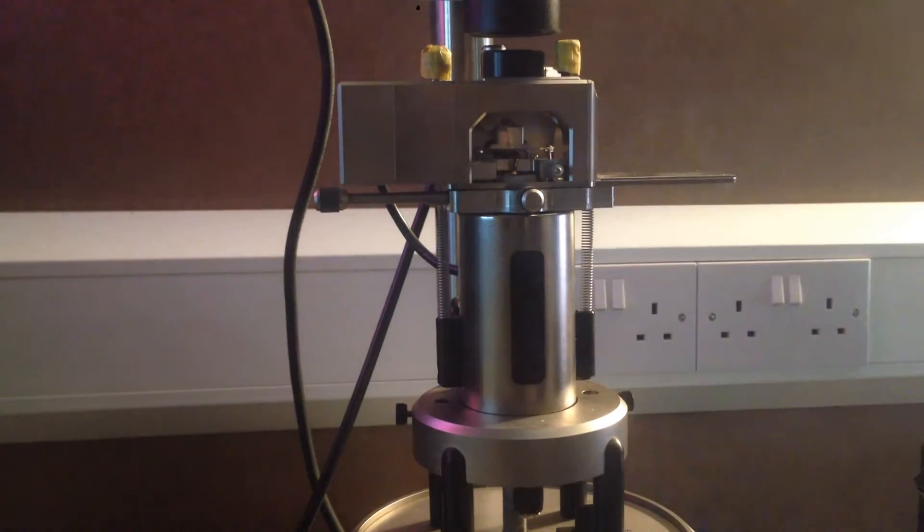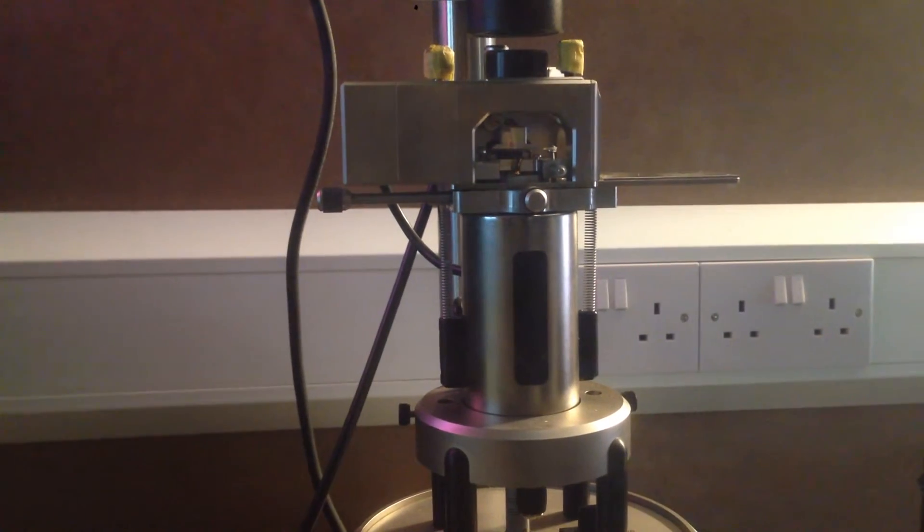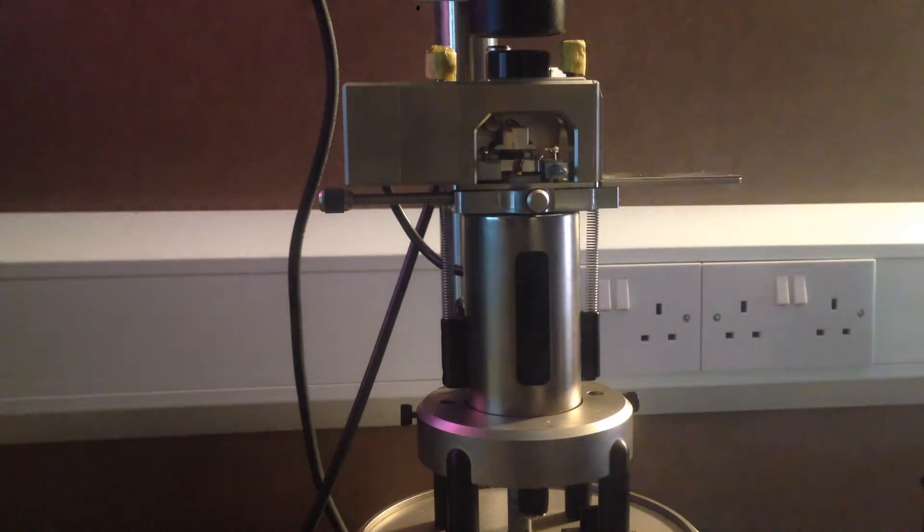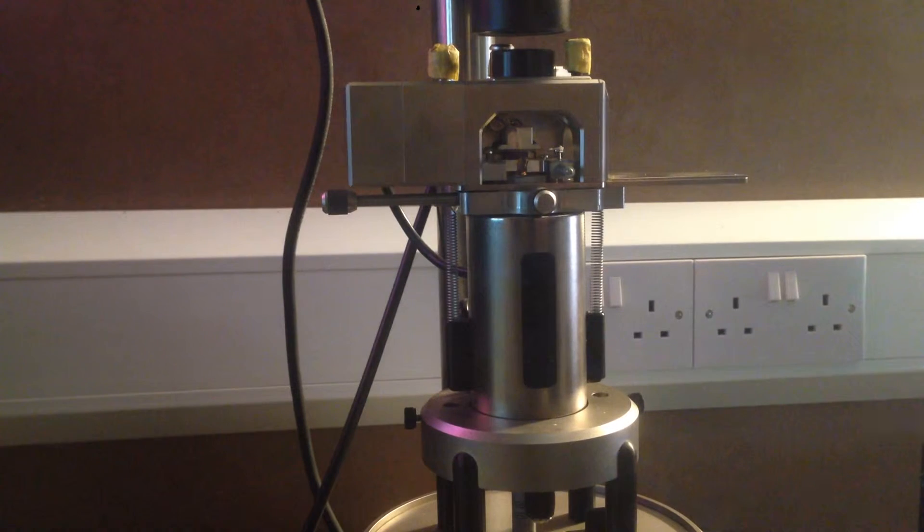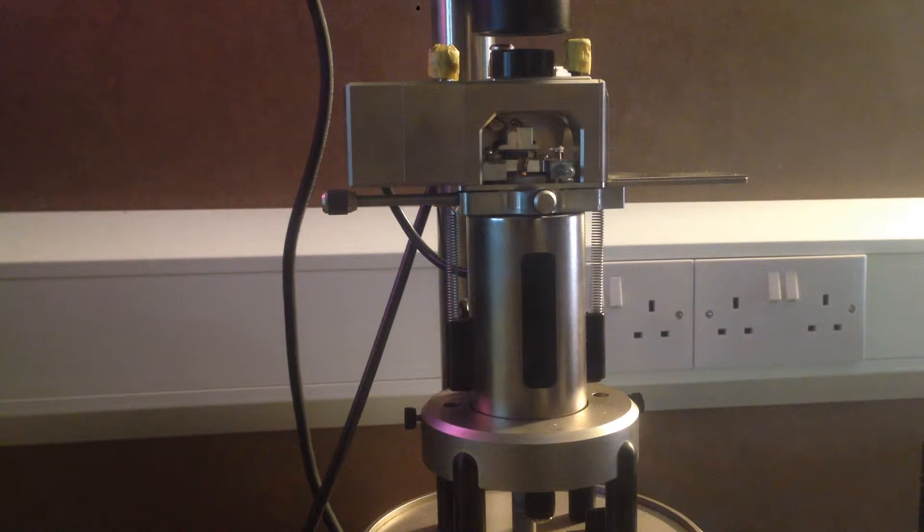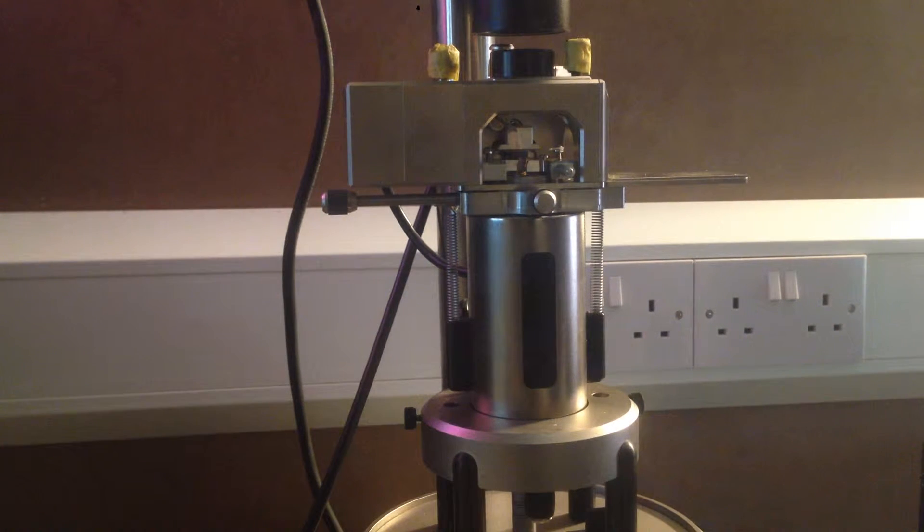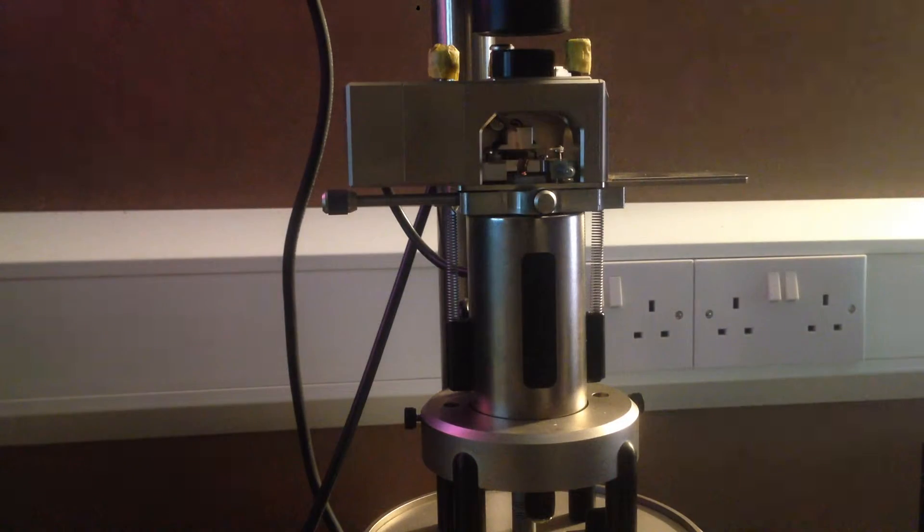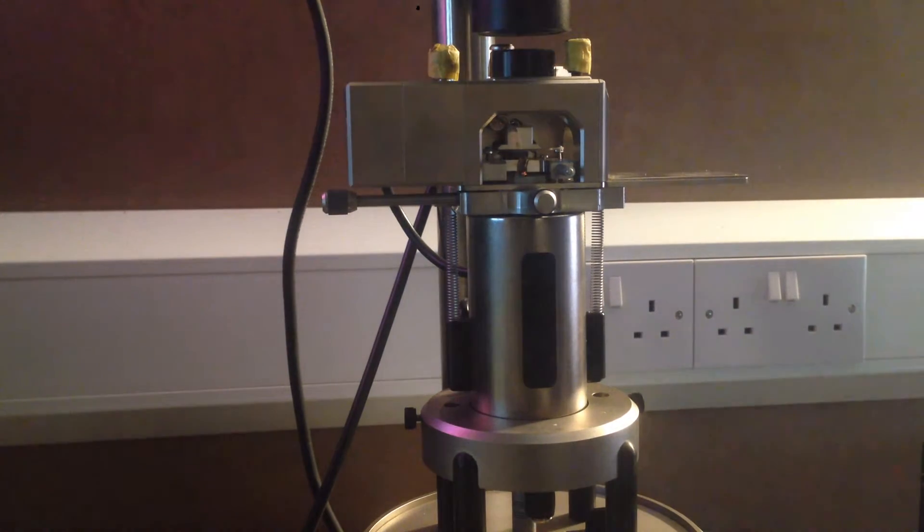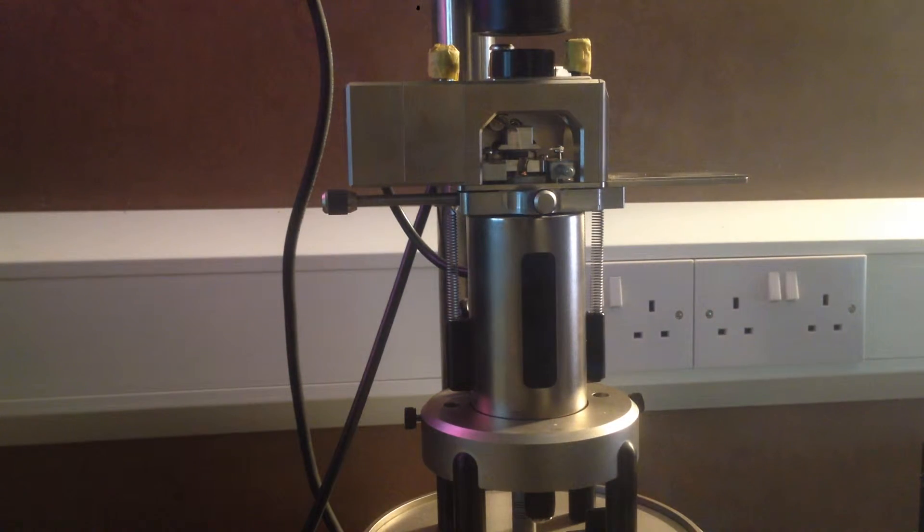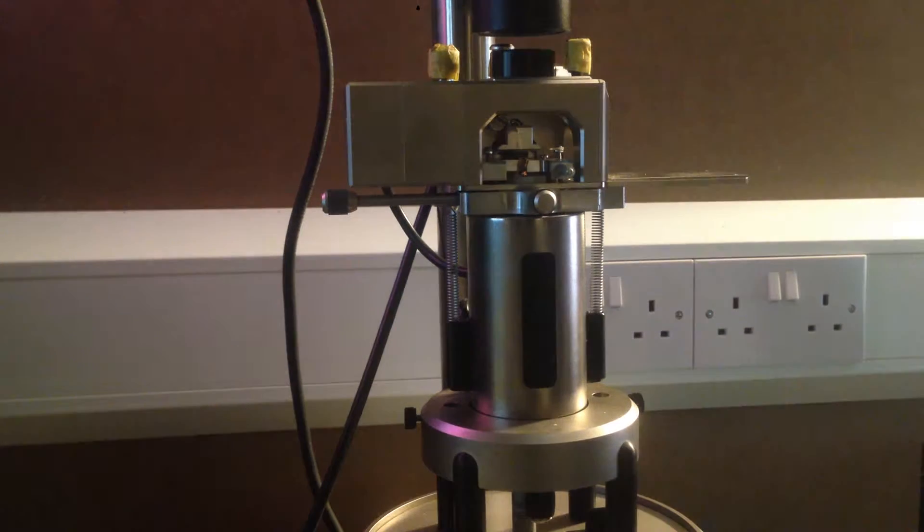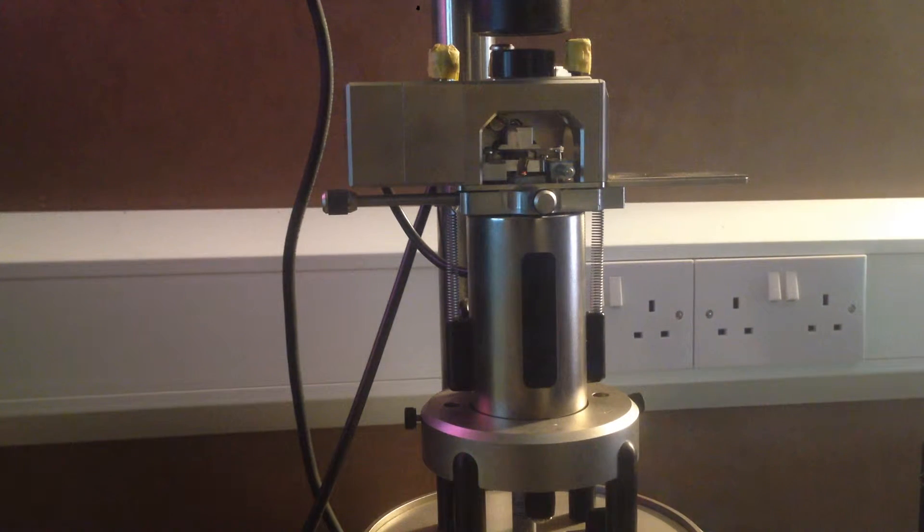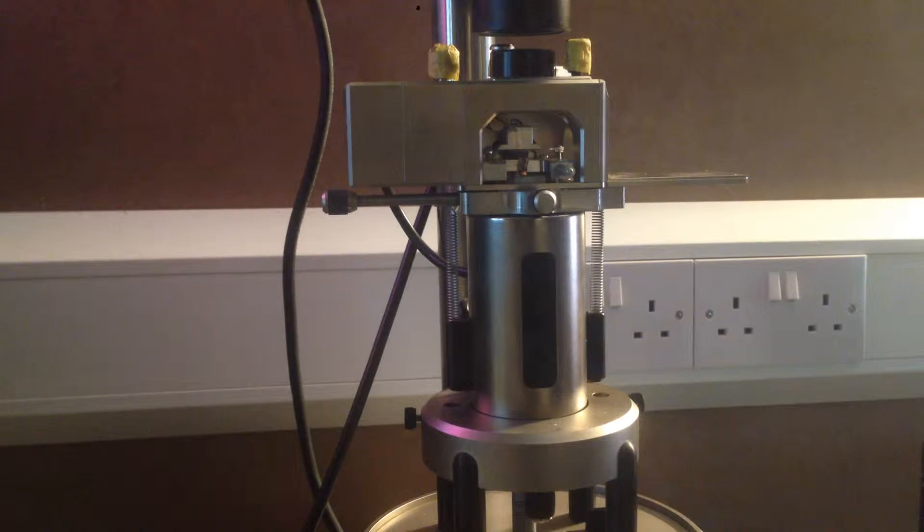Once we've done that, we move the sample closer to the cantilever. It may be that it's actually better to do that before aligning the laser, because you may be able to get some reflection off the sample.